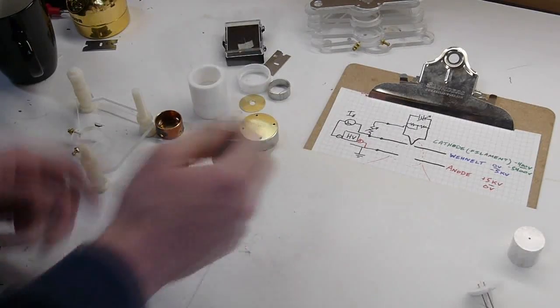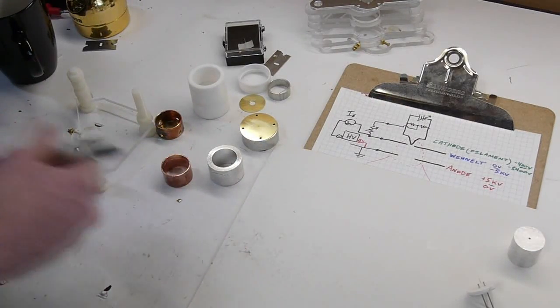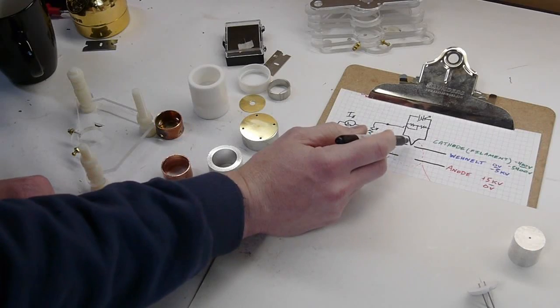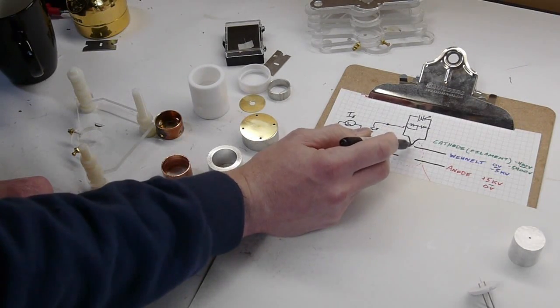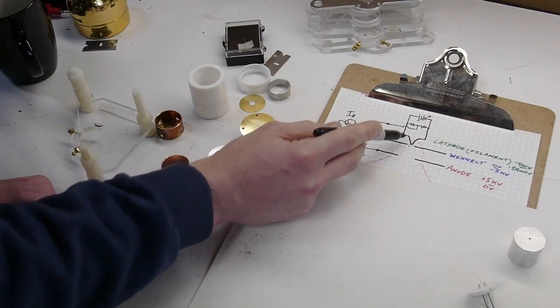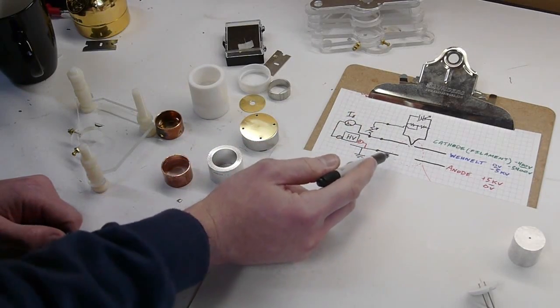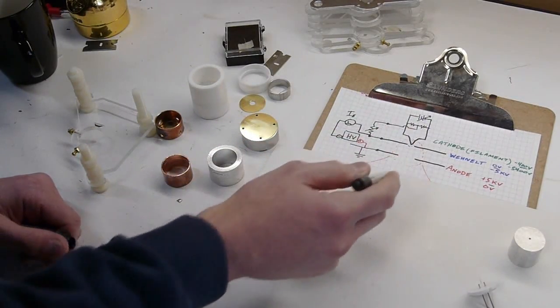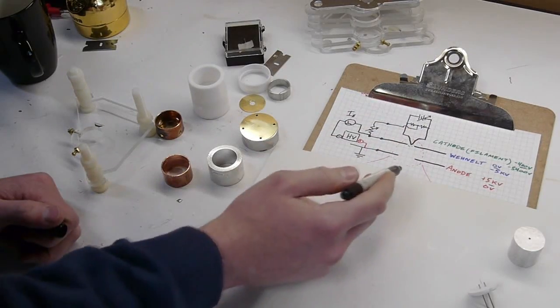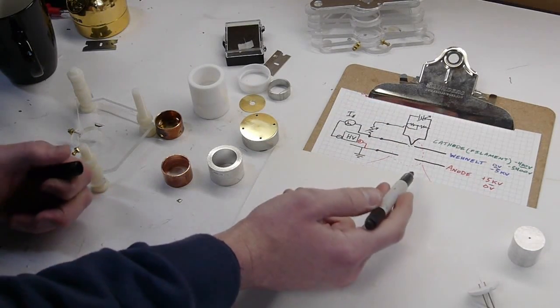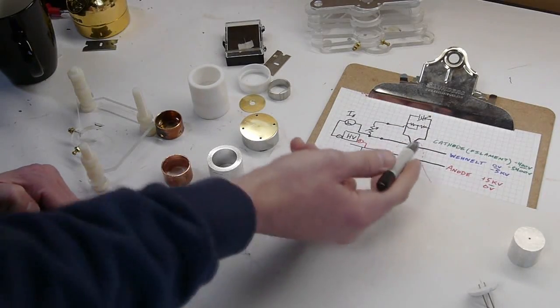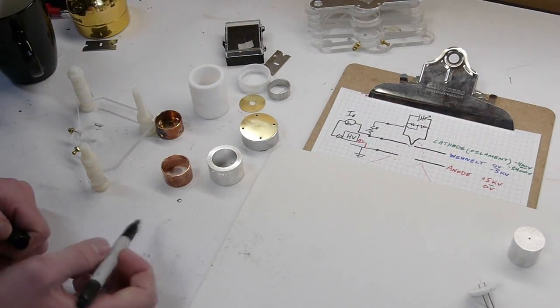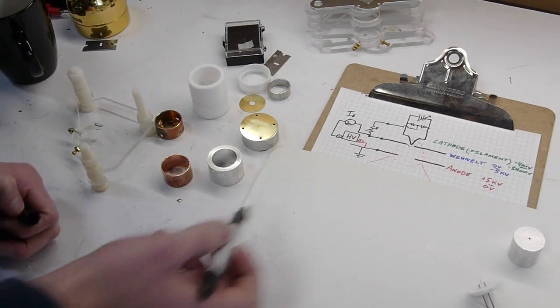Because if you think, if you take it literally, the electrons are boiled off of the filament, just think of these little specks coming off the filament and they're drawn towards the anode, so they're shooting down here. But as soon as they go through the hole in the anode, if they were attracted to the anode in the general case, they would be pulled back up towards the anode again. That doesn't make any sense. That's not how it works.